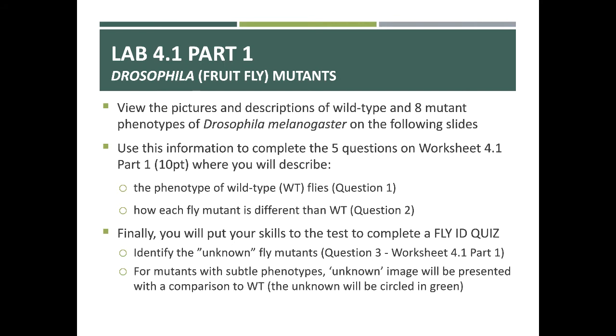You'll see in a moment, and I'll show them to you, that flies with subtle phenotypes will be presented with a comparison to wild type. The unknown will be circled in green. But first, let's take a quick peek at the mutants and wild type.